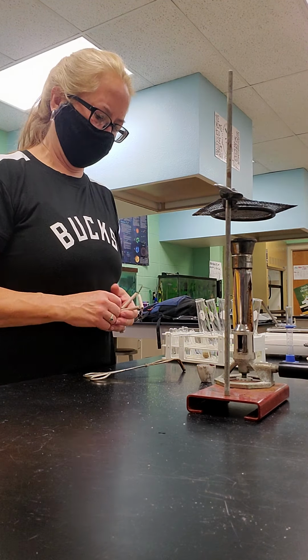All right, now go ahead and finish filling out the table. So you can do like Will did. He filled out all the observations and then decided if it's chemical or physical. If it's chemical, you're going to get a new substance formed. You're going to get either a gas, a precipitate, a color change, or energy exchange. Okay? If it's physical change, it stays the same substance. All right, there's part two, and I'll put part one of the video on for the first part, part A.